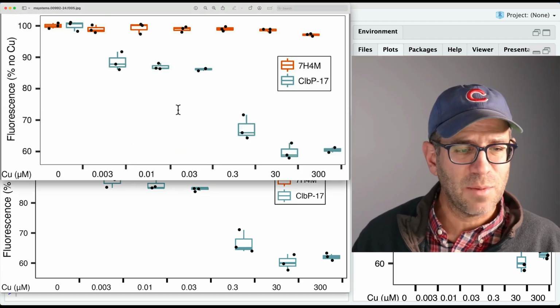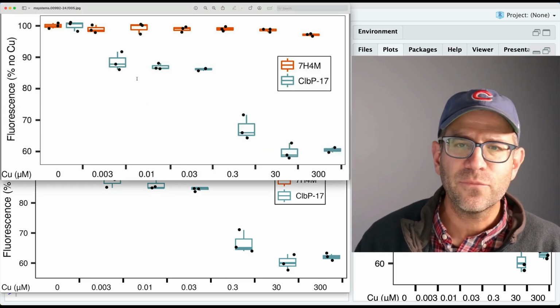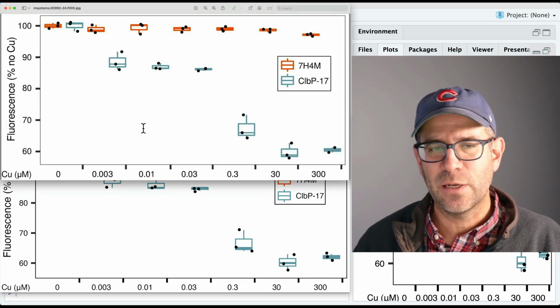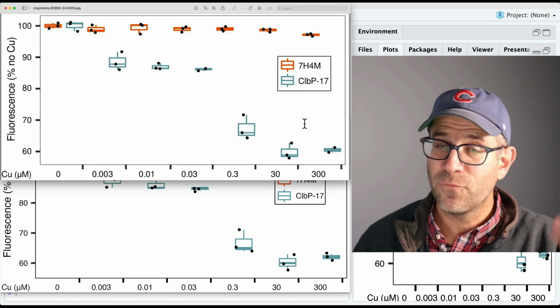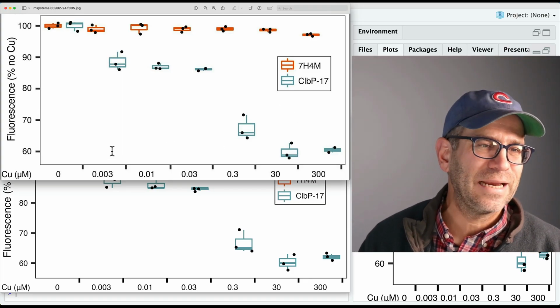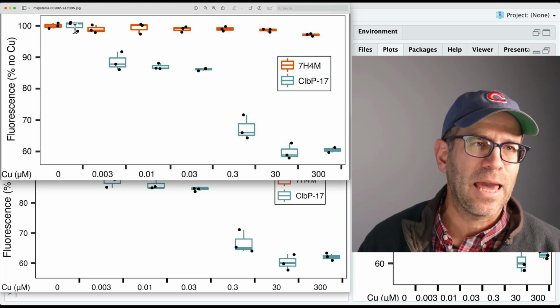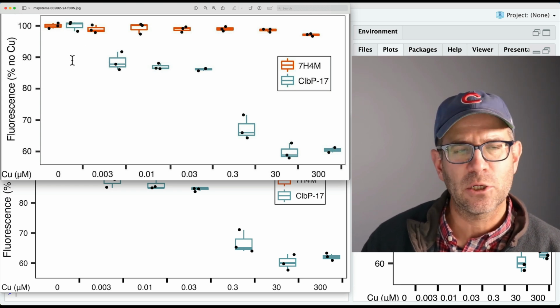So I think I've done a good job of replicating their figure fairly well. Their version isn't what I would do if I was playing with these data. If you watch the next episode, I would show you what I will do with these data. Again, I kind of go back to the beginning where they've got these gaps between the two different treatment groups.